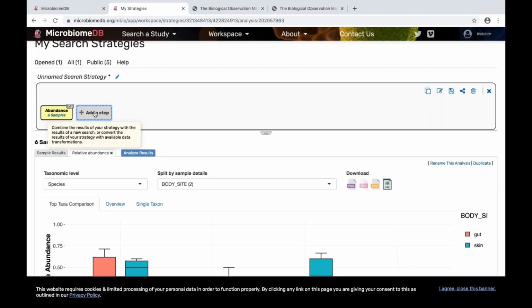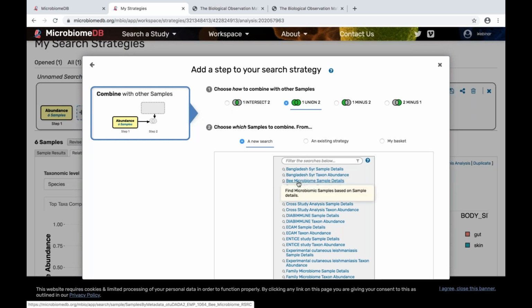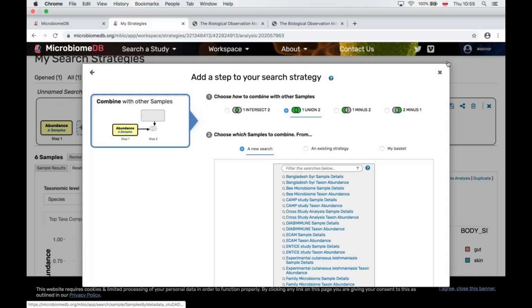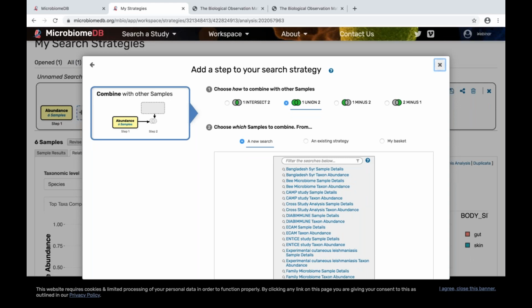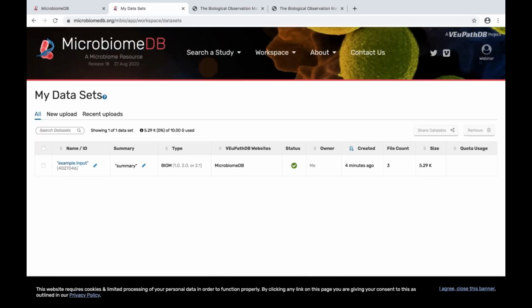We have this from the genomic sites, but you're actually able to use this to view both your data set and another data set together in the apps, just so that they're there for context. Okay. So yeah, this is it.